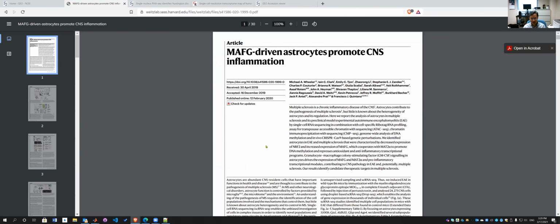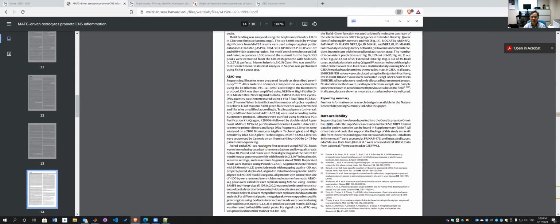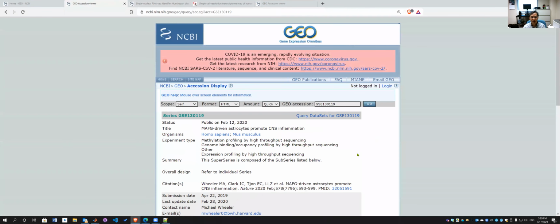Keep looking. Okay, something like this. This GEO, this paper.